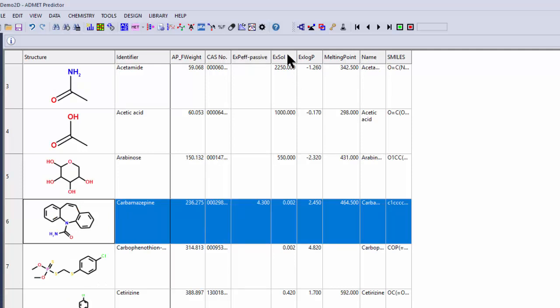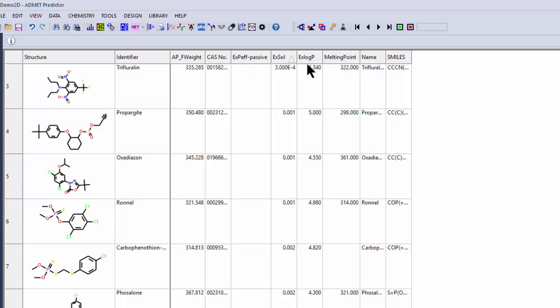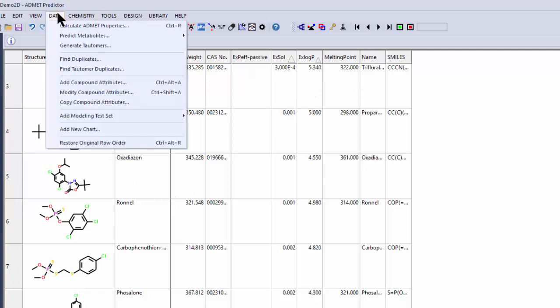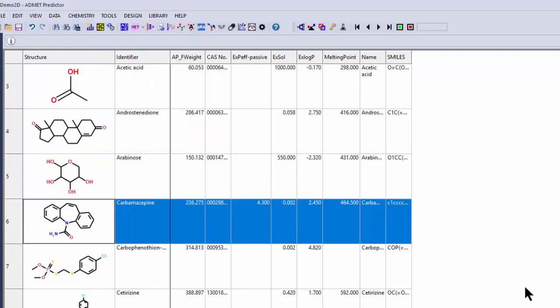You can also do hierarchical sorts. If you have a column that potentially would have ties — the same number in two consecutive rows — you could sort that and then hold down the Control button to sort another column relative to that one. Any areas where two cells would be the same, it would sort the other rows according to a hierarchical system. If you ever have to restore the original order, you can go up to Data, Restore Original Row Order, and that'll put everything where it was when you first read in the file.